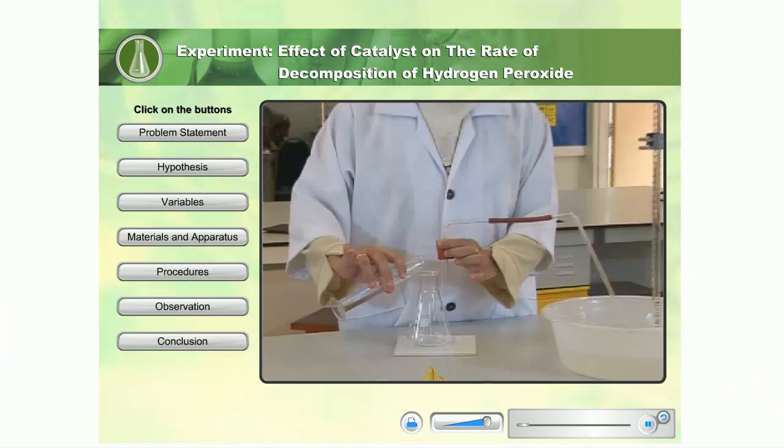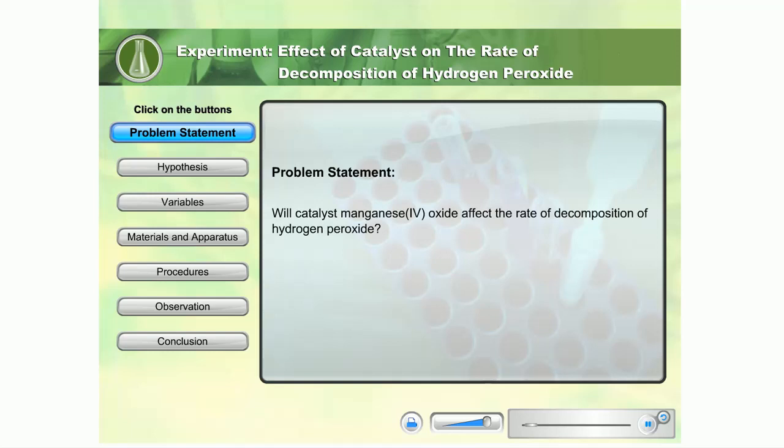Do catalysts affect the rate of reaction? Let's investigate the effect of catalysts on the rate of decomposition of hydrogen peroxide. Will catalyst manganese 4 oxide affect the rate of decomposition of hydrogen peroxide?